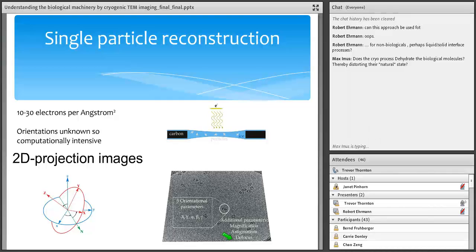If you're a material scientist, you don't need to do that. You can just simply work at focus and see the individual atoms. We can't do that because by the time we see the atoms, everything would be turned into ionized material. Water becomes superoxide radicals and hydrogen molecule gas, and then a bubble will pop, and then everything will get broken down into the elemental. It won't be a biological material anymore. It will be carbon, oxygen, and nitrogen in different forms.